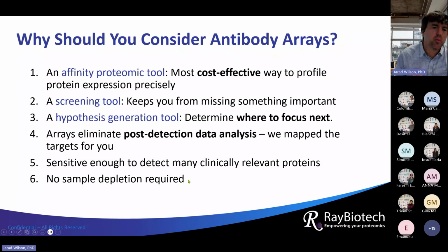So just if you're not familiar with arrays and why you might want to consider them, from a high level, they're a very cost-effective way to profile some set of proteins and the expression pattern. It's a good way for either a screening tool or, as my boss likes to mention, a hypothesis generating tool. You've got a drug or a treatment on some cells or in some mice, or in a patient that has an effect, but you have no idea what's going on.